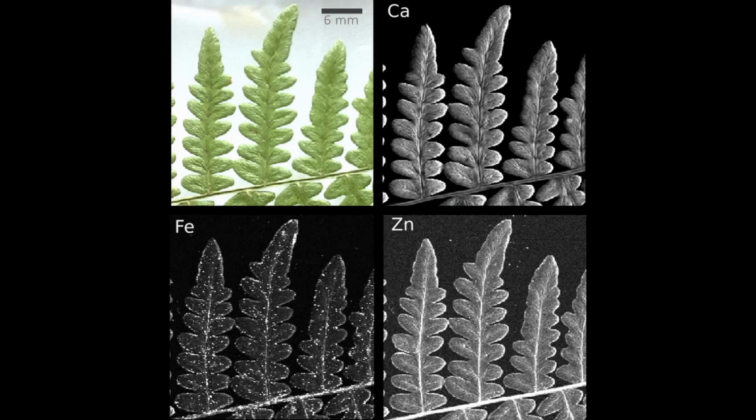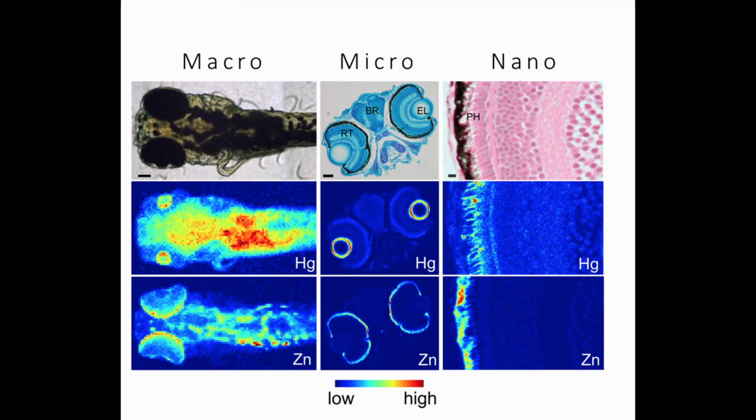Right now we are at the BioXAS imaging hatch. It's one of the 3 BioXAS beamlines, and this is where I spend most of my time assisting scientists coming to Canadian Light Source from all around the world to measure their samples. On our beamlines, they will bring plant tissues, animal tissues, pieces of rock, and they will leave C.L.S. with images of elements in their samples, and especially images that show distribution of those different elements in their tissues.